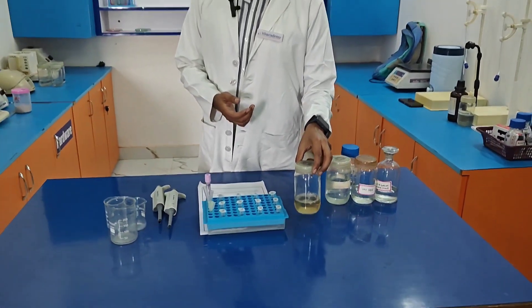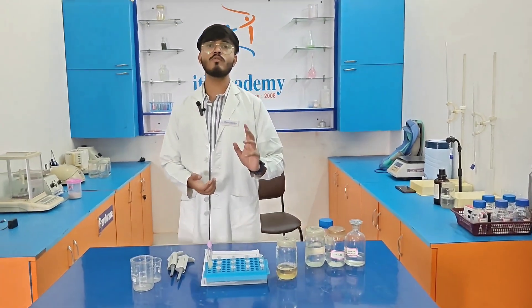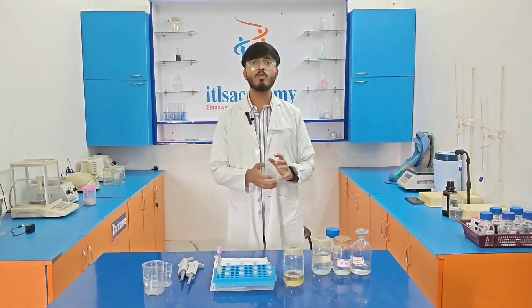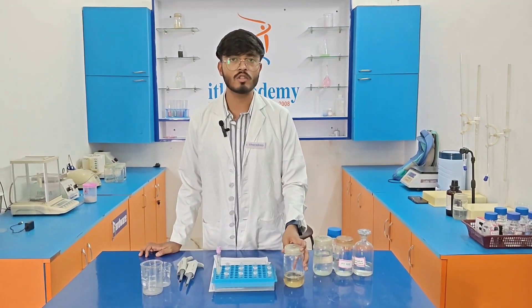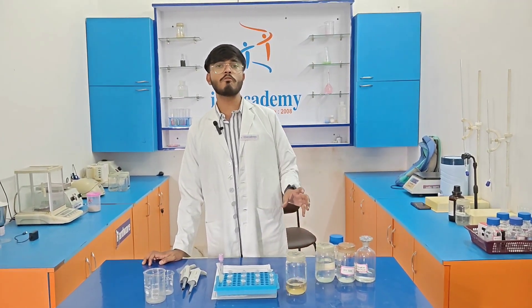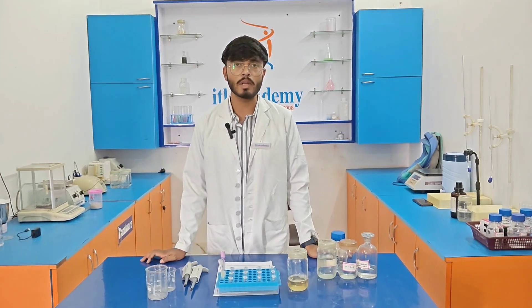First of all, we are going to talk about how we prepare lysis buffer and what is its function. Lysis buffer is basically used for the disruption of the cell membrane.